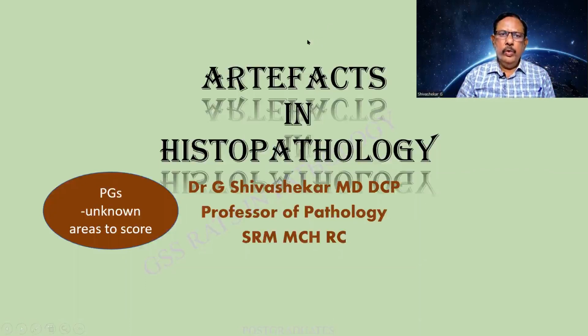Welcome to a new class on artifacts in histopathology. A thing of beauty is a joy forever. In fact, the word artifact means a beauty. However, it also means an error or a disparity from the constant appearance. This is an unknown area where the postgraduates can score. We will be having any number of hidden viva voce questions in this.